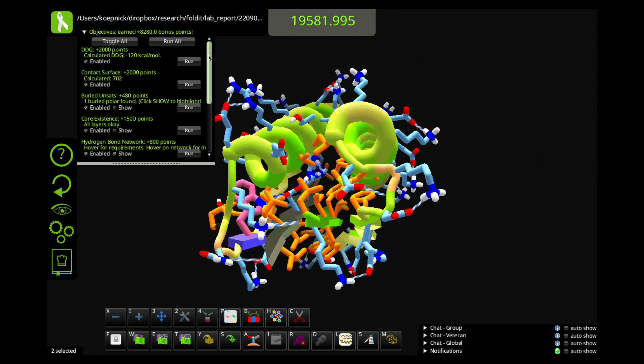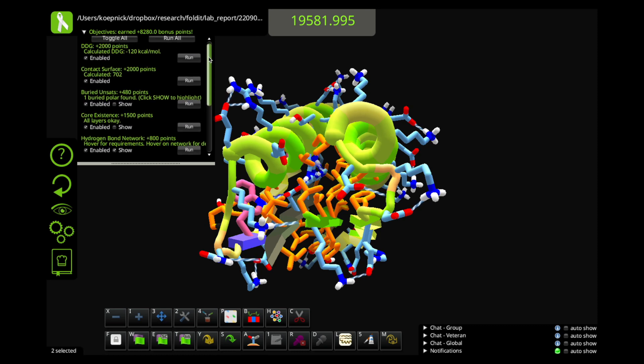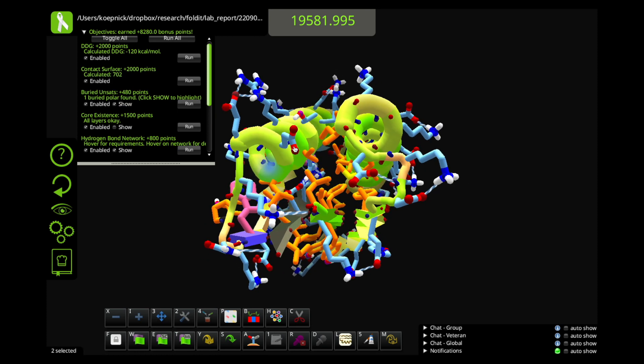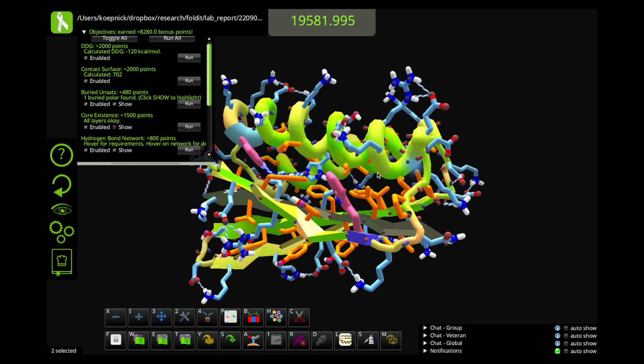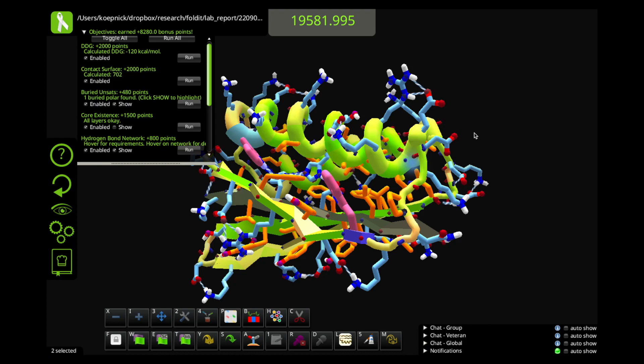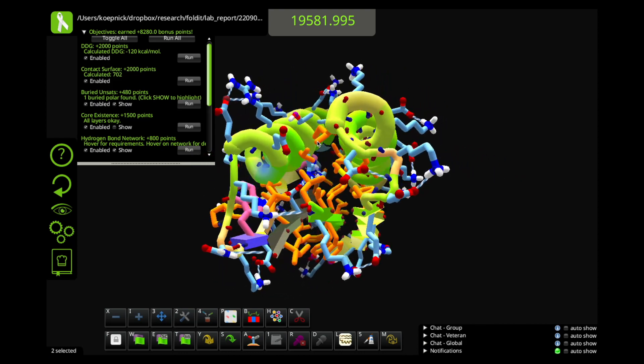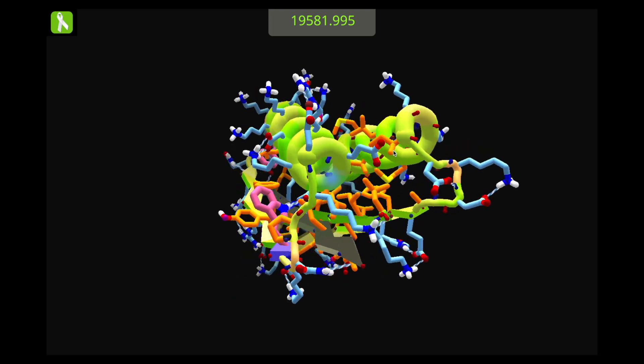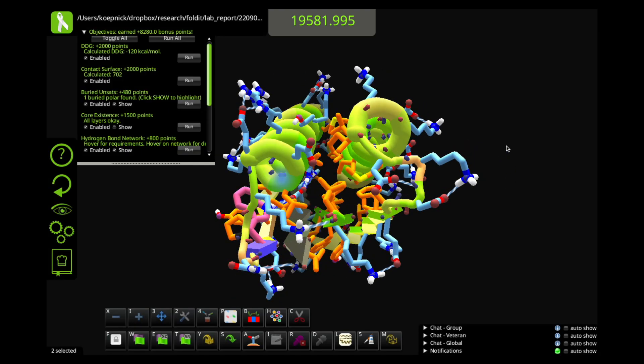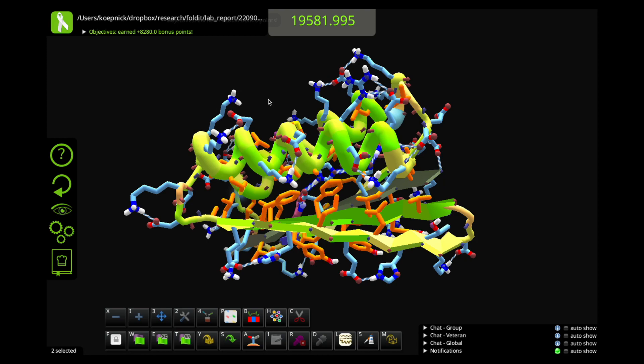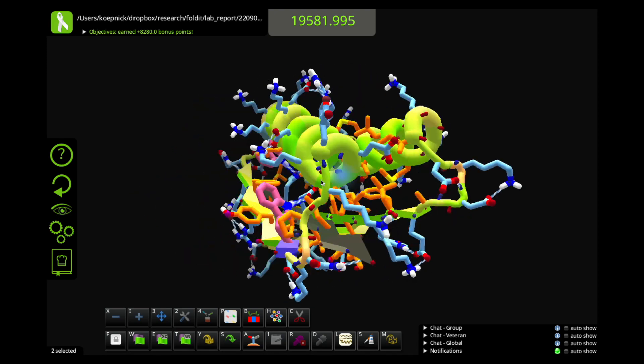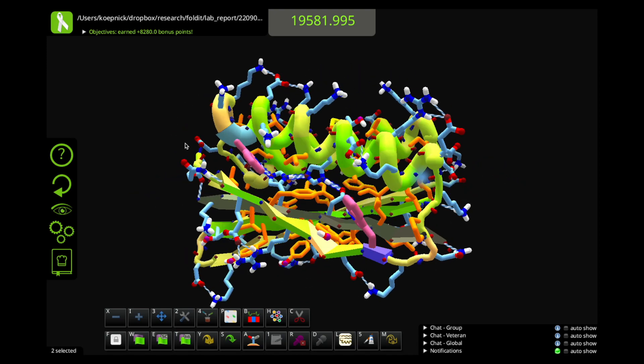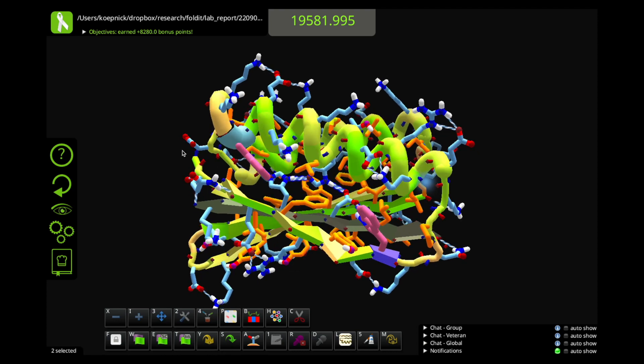On top of that, this protein just has really excellent metrics across the board. It's excellent DDG and contact surface. We see only one BUNS atom has been flagged. This doesn't look too much of a problem to me. This nitrogen pointing inward from the helix can probably be satisfied by water without too much difficulty. So all in all, this looks like a very nice strand binder design project, designed by Bruno and Iqvildizanaman.